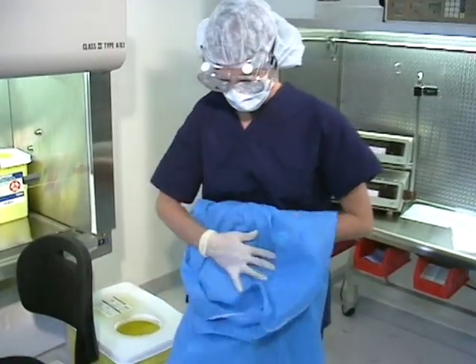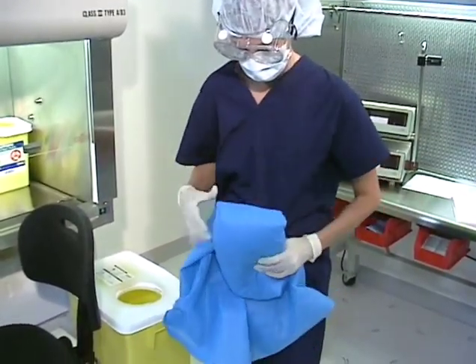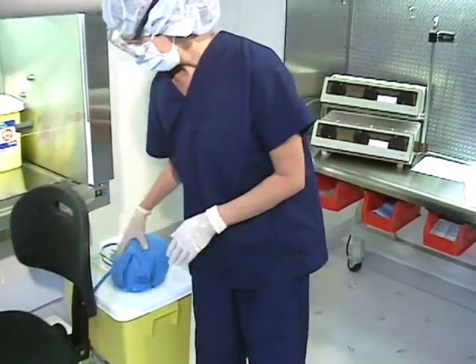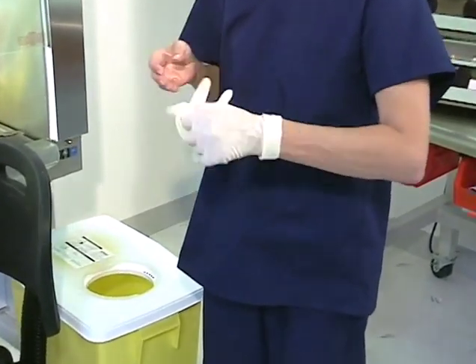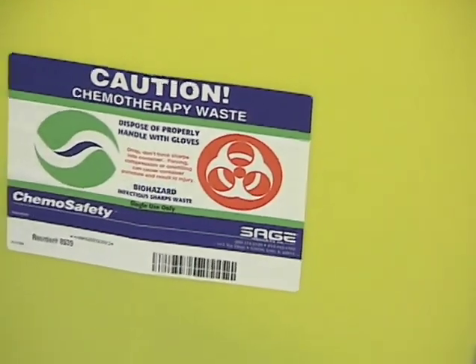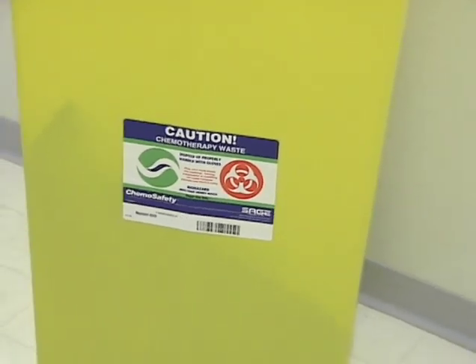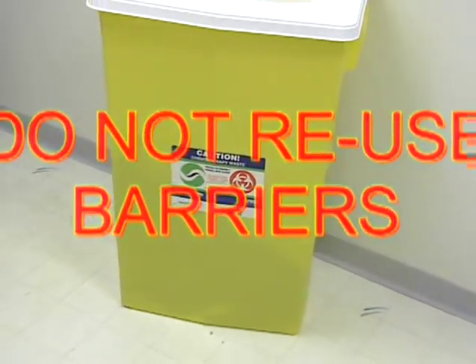The gown will now be inside out, with the sleeves contained, and may be gently rolled into a ball for disposal. After degowning, remove the inner pair of gloves in the same manner as the outer pair. Remaining items of gowning can now be removed. All gowning should be placed in a chemo waste container. Remember, no gloves or gowns used in compounding hazardous substances should ever be reused after degowning.